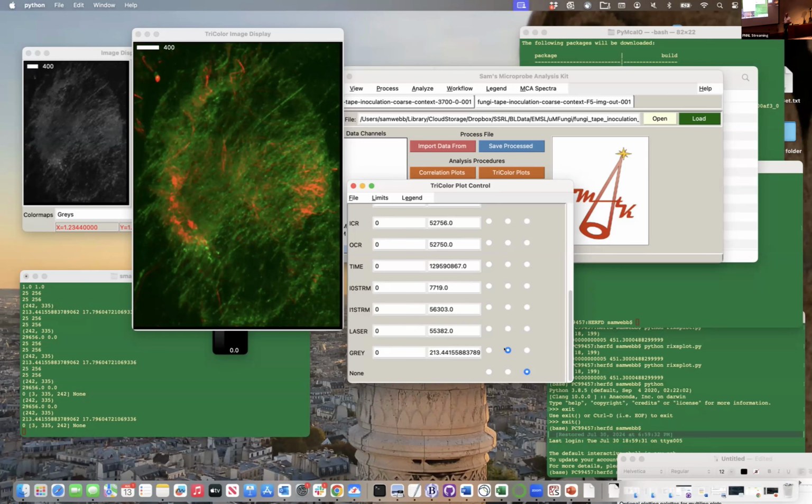Occasionally, you will find that they don't exactly match. The reason is often that when we have our optical images, if it's not exactly along the same axis as your data collection, you can have a little bit of parallax. And if you're off focus on your instrument, those may not always match up.